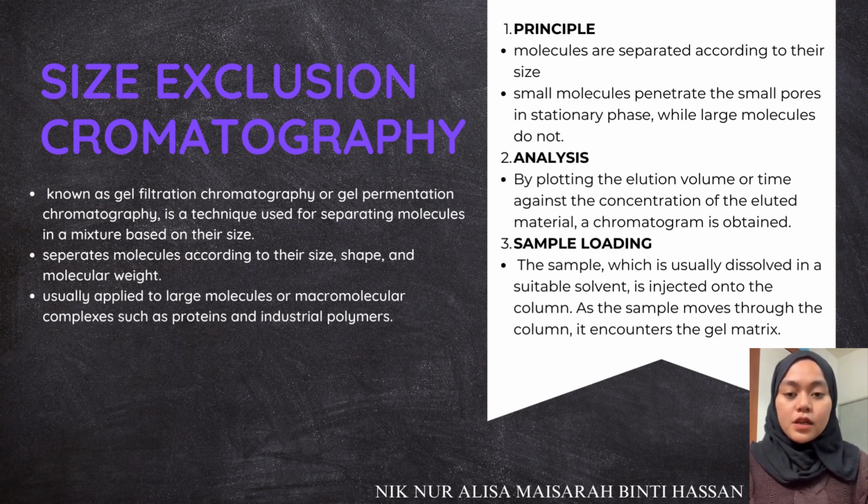Lastly, sample loading. The sample, which is usually dissolved in a suitable solvent, is injected onto the column. As the sample moves through the column, it encounters the matrix.